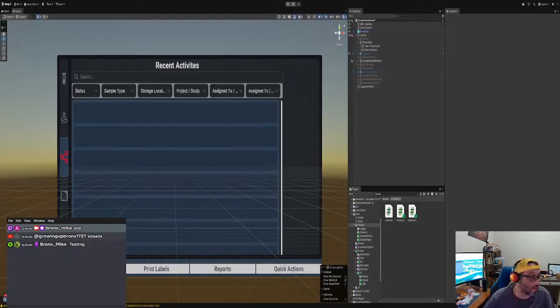All right, so let me see. Make sure I got everything up and running. Hold on a second. Give me 1 second. All right, just so I could get these chats up here. Make sure I can see them.